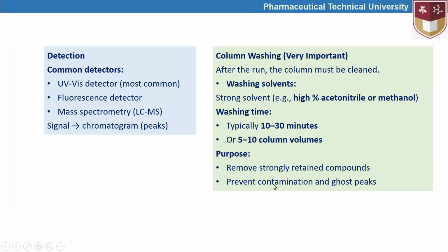This is very significant. After using the HPLC for the same purposes, let's say we used it 10, 15 times a day, after utilization they have to be washed, possibly with a higher concentration of acetonitrile, because acetonitrile is more hydrophobic compared to water, so the compounds that might have higher hydrophobic interactions with the C18 silica gel could be more effectively washed with a higher concentration of acetonitrile.